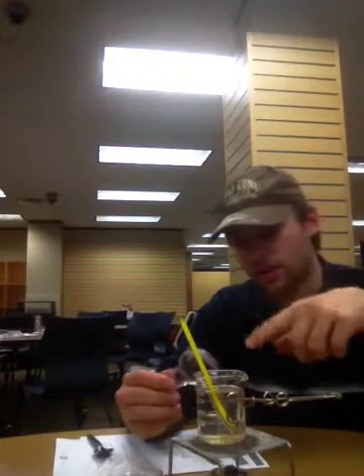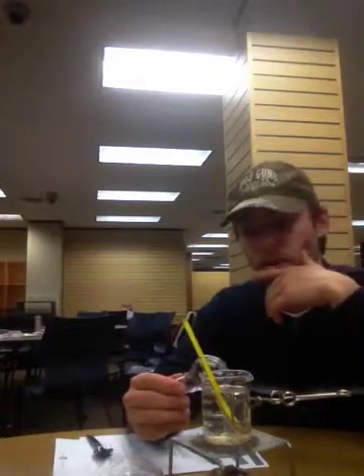So this one actually melted at a lower temperature, but it took longer. I don't know if the water bath was not heating as fast, but it seemed to take longer to reach that other point. Although the range is very similar, 32 to 40, 43 degrees Celsius. So anyway, that's the experiment. That's the basis of it.